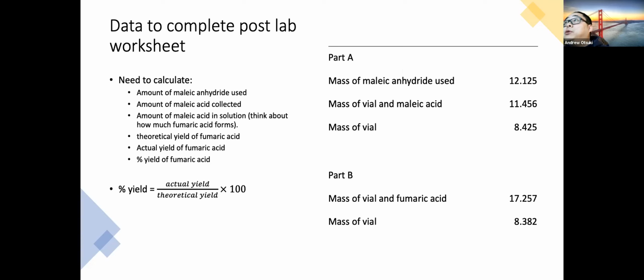Like you have perfect reaction completion and perfect isolation technique, but you know that's impossible because you can't recover everything from the flask. There's going to be stuff that sticks to the flask, and stuff that's lost during transfer, for example when we transferred the filtrate from part A into another flask and let that cool. So there's always going to be some loss. And remember, some maleic acid crystallized, so that contributes to a loss. So percent yield will never be 100.